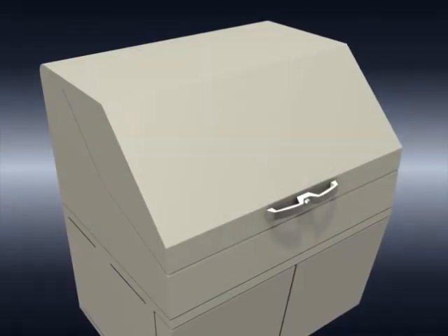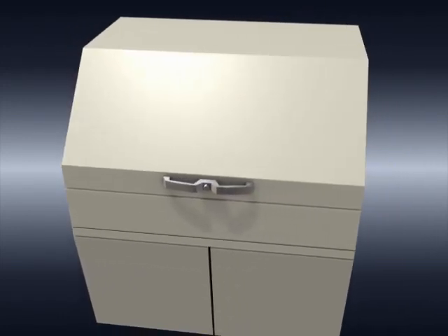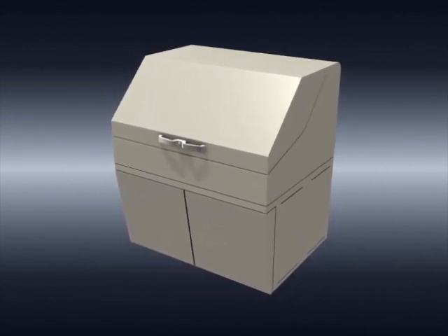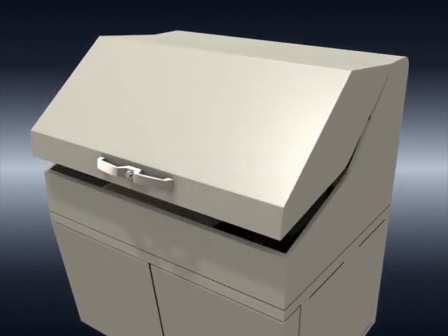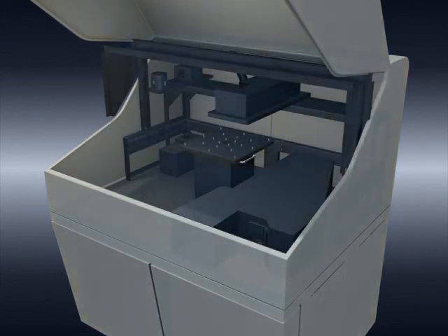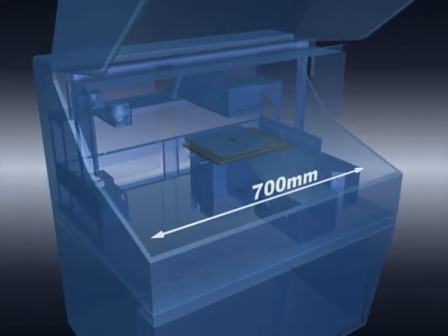Another feature of the SolidSpec 3700 is the extra-large sample compartment, which allows non-destructive testing of large samples from the flat panel display industry. The SolidSpec 3700 system, which integrates the monochromator and sample compartment into one large unit, is placed on the floor. The sample compartment can accommodate samples of up to 700 millimeters in width and 560 millimeters in depth, allowing full area measurement of 12-inch wafers with diameters of up to 300 millimeters.